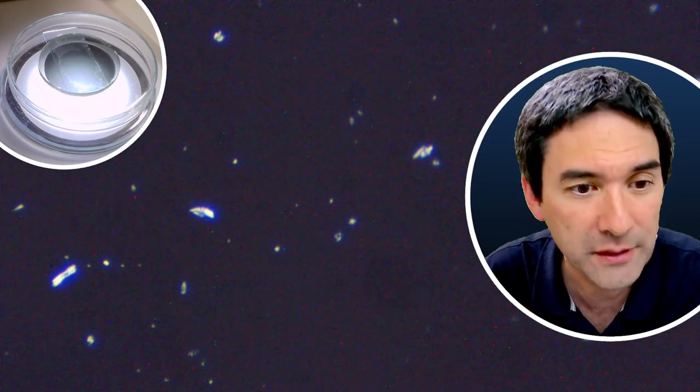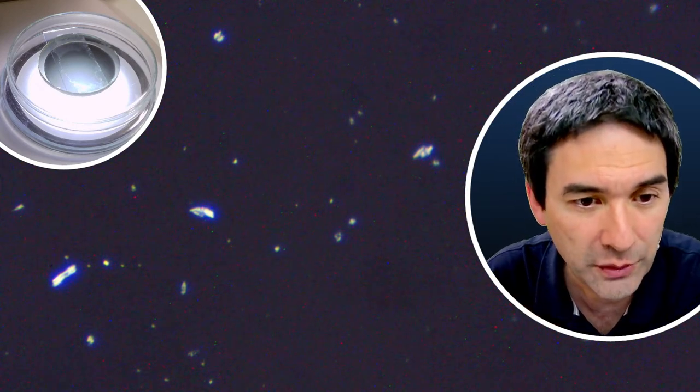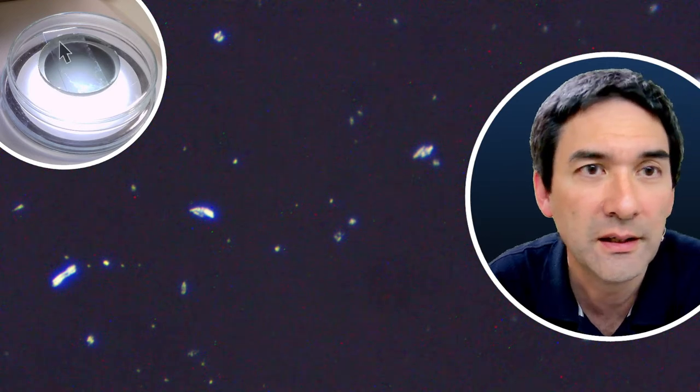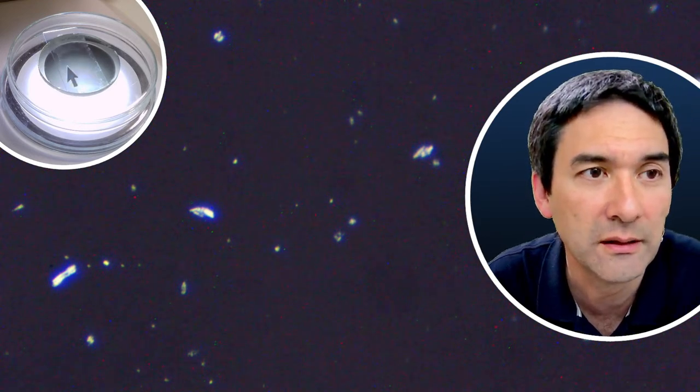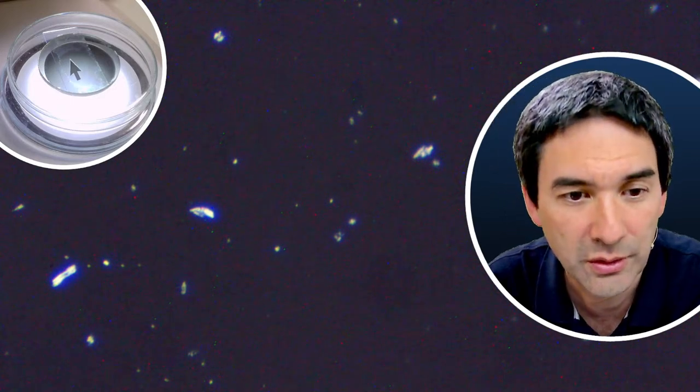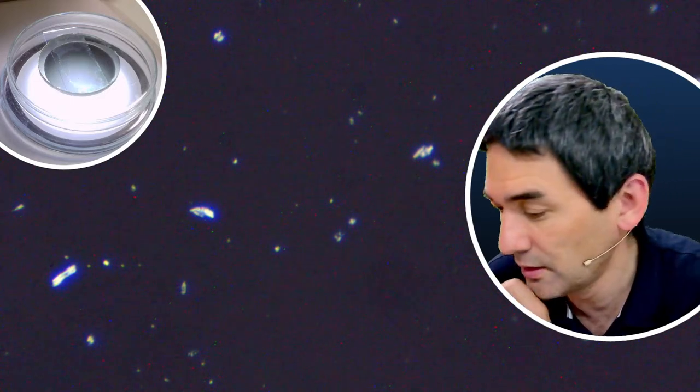Maybe you are able to see, if I turn on the arrow here. Maybe, I don't know if you're able to see this over here on the side. It's a little bit white, the slide. And in the center, it's still a liquid, yeah? But I see that it's now starting to slowly crystallize.